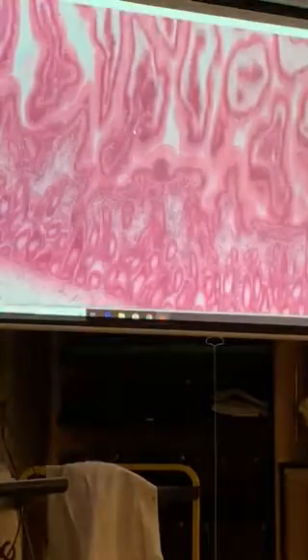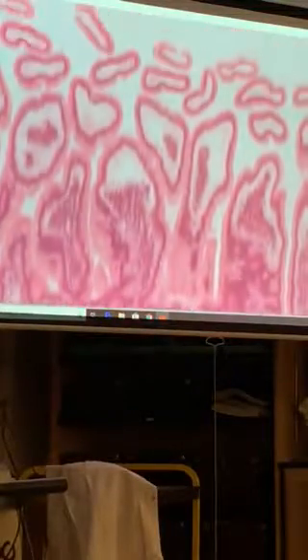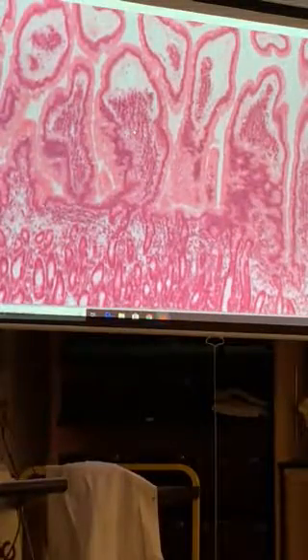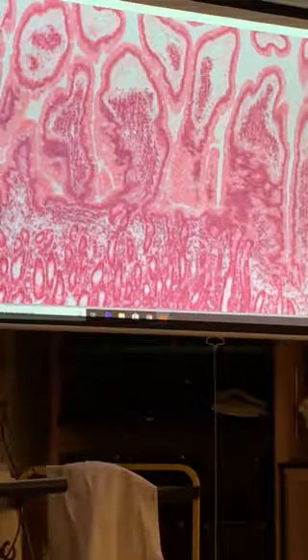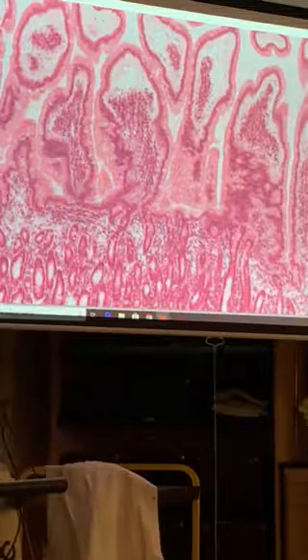It's kind of a crazy one with all the extra pieces on the end. Okay, so it does have some extra pieces on the top, but I'm trying to sort of cut those off so we can get a more typical looking example here. So we're going to do number 19, new slide. Name the organ, and I will move across the slide for you here in a moment.